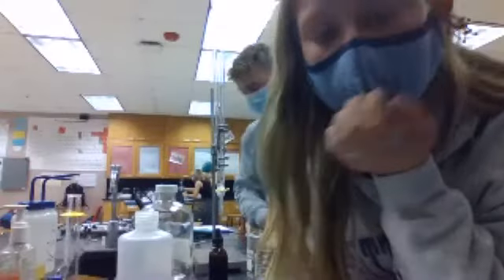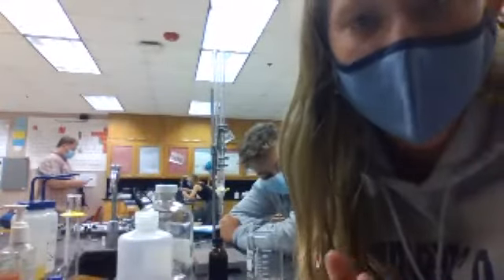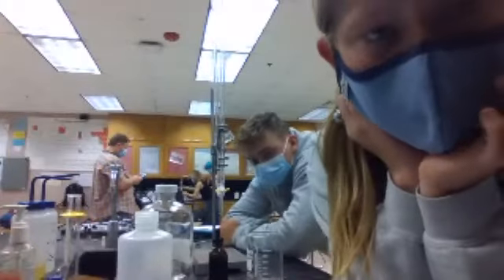Okay, wait. So the 8.47 is the final volume? No, it's just around where we need to start looking for the final volume. It's near. Oh, okay. We find the final volume when there's a color change, and that's when we write it down and we find the difference. Oh, okay. So what's the pH level at 0?